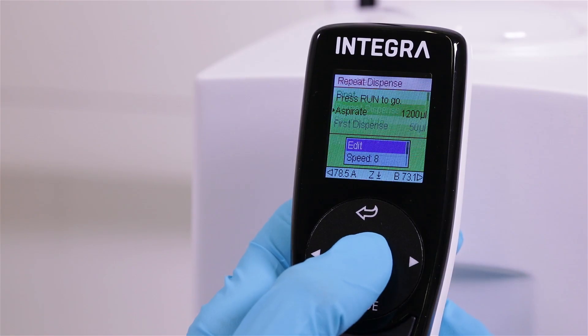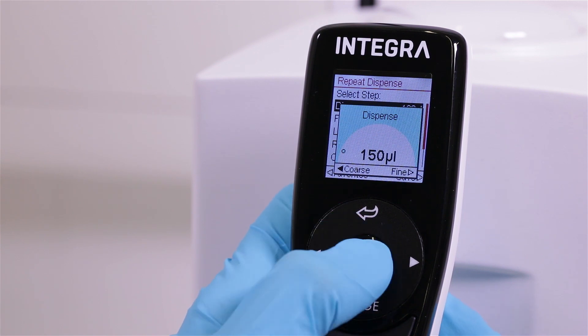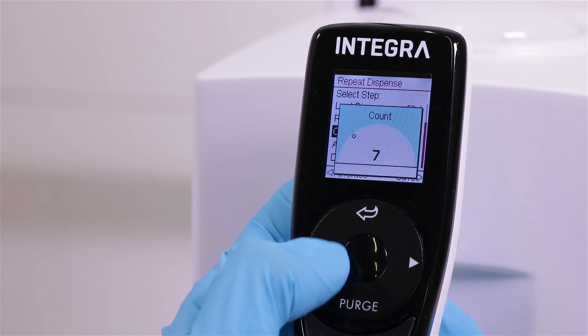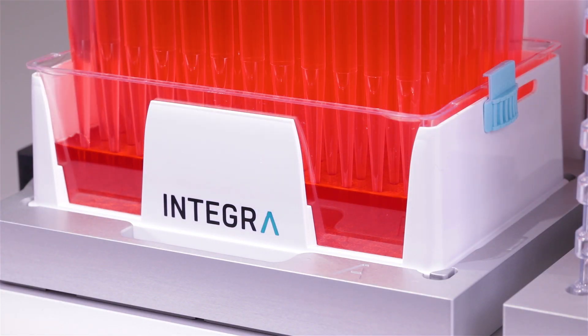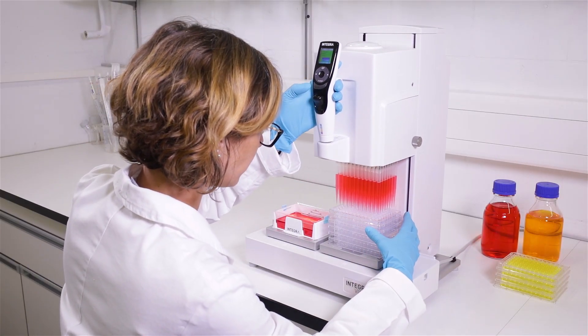Repeat dispense mode allows precise dispensing of multiple aliquots from a single aspiration, enabling extremely efficient and fast filling of multiple microplates. Filling six 96-well plates takes only 30 seconds. In comparison, filling the same six plates with an eight-channel pipette takes almost two minutes.